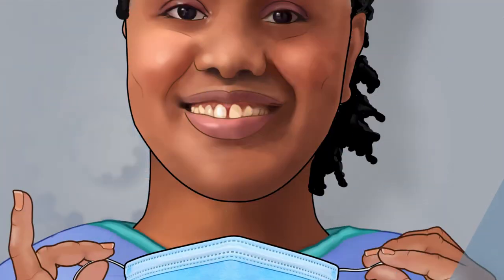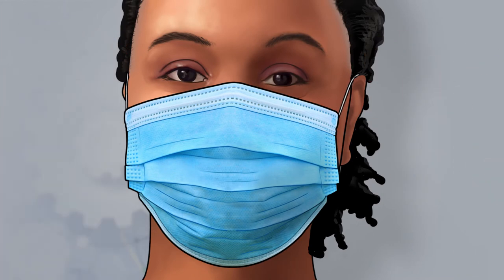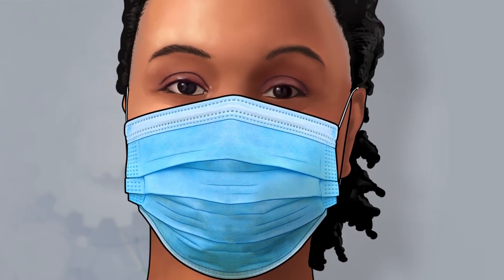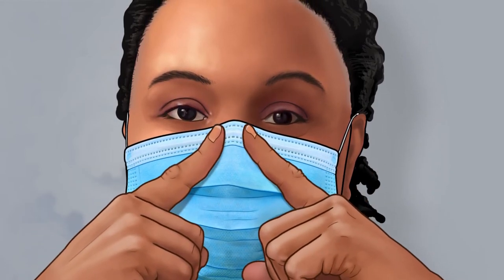Next, put on your disposable face mask with the ear loops behind your ears, ensuring a snug fit against your face. With the index finger of both hands, press down on each side of the flexible nose piece so that the top of the face mask fits snugly against your nose and cheeks.